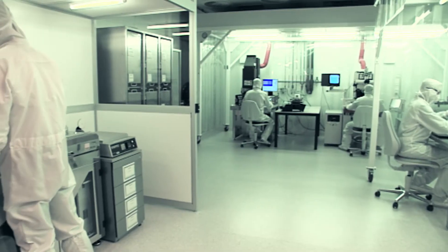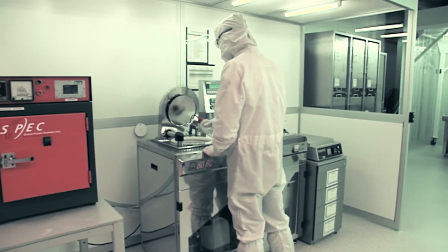While elasticity measurements can be conducted with extremely small quantities of tissues and cells, they however require expensive, dedicated analytical equipment as well as trained personnel. Furthermore, the sample throughput remains very low and analysis requires an entire workday.